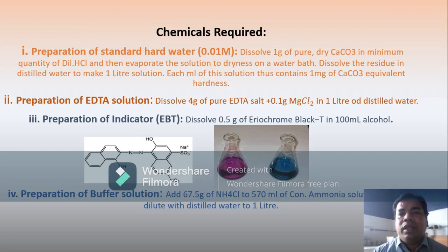Okay, so these are the chemicals required for the determination of total hardness of water by using the EDTA method.